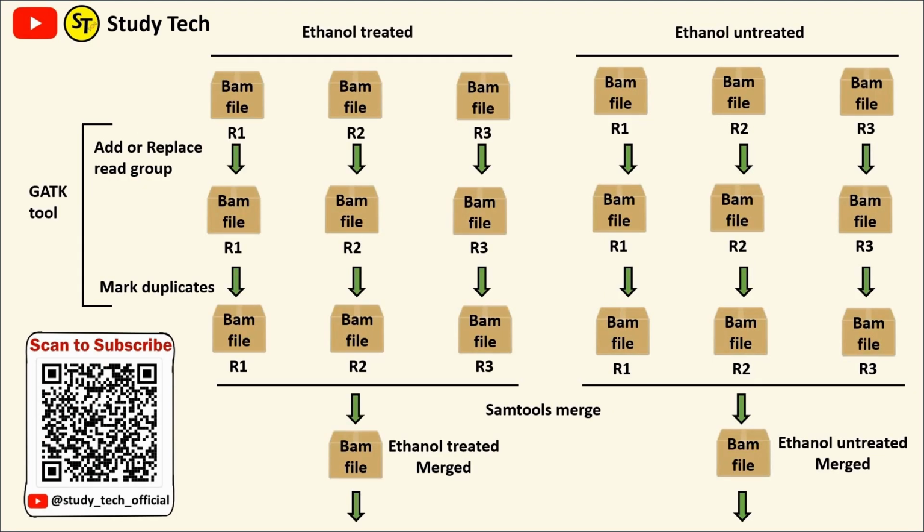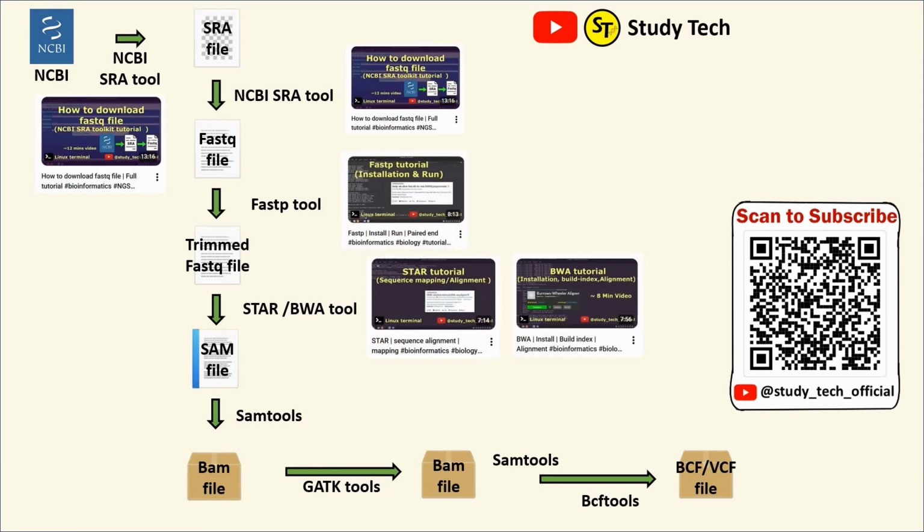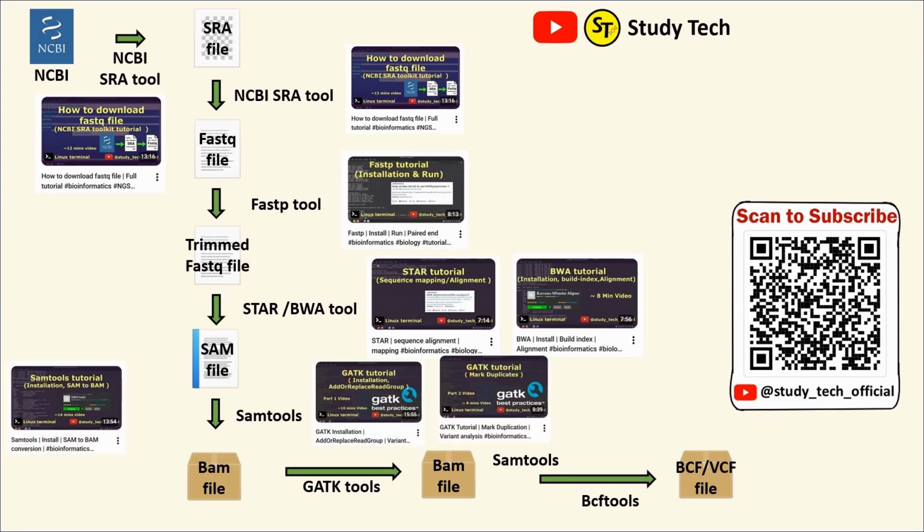In my previous video, I already demonstrated how I made this merged BAM file. So check out my previous video. You can also follow my whole pathway and the tutorial to make this BAM file and do genomic variant analysis.